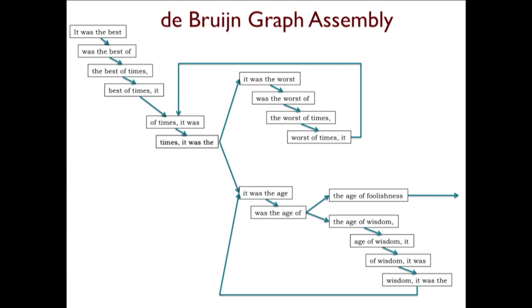Sometimes it'll just be one fragment followed by exactly one more, by one more, by one more. Those are kind of unambiguous parts. And then sometimes there's going to be this branching involved. And that's going to be as we transition between different repetitive elements.